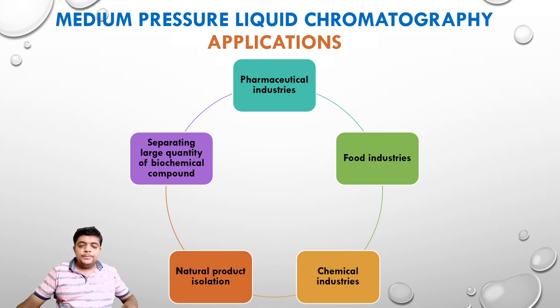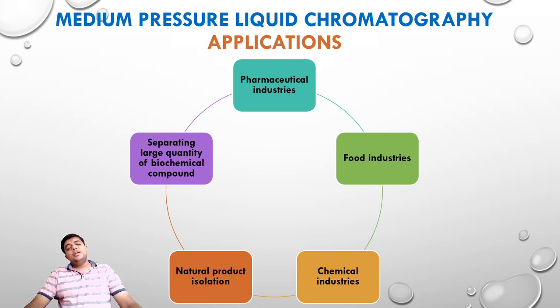So friends, this was an introductory part of the Advances in Chromatography online course through the first short lecture, MPLC, medium pressure liquid chromatography. There will be two more lectures coming in the two consecutive videos: preparative HPLC followed by UPLC. Friends, based on the feedback from the basic course on online chromatography and even the feedback after the intermediate test, we have designed 12 to 14 lectures, where the first three set of lectures are MPLC, preparative HPLC, UPLC.